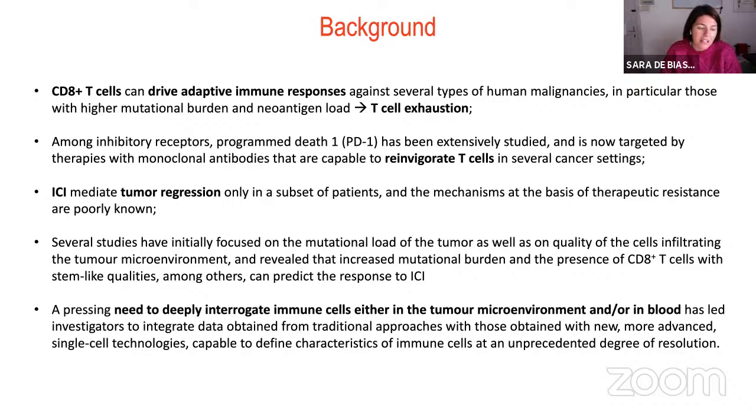So there is a pressing need to deeply interrogate immune cells, both in the tumor microenvironment and in blood. This has led investigators to integrate data obtained from traditional approaches with those obtained with new, more advanced single-cell technology, capable of defining characteristics of the immune cell at an unprecedented degree of resolution.